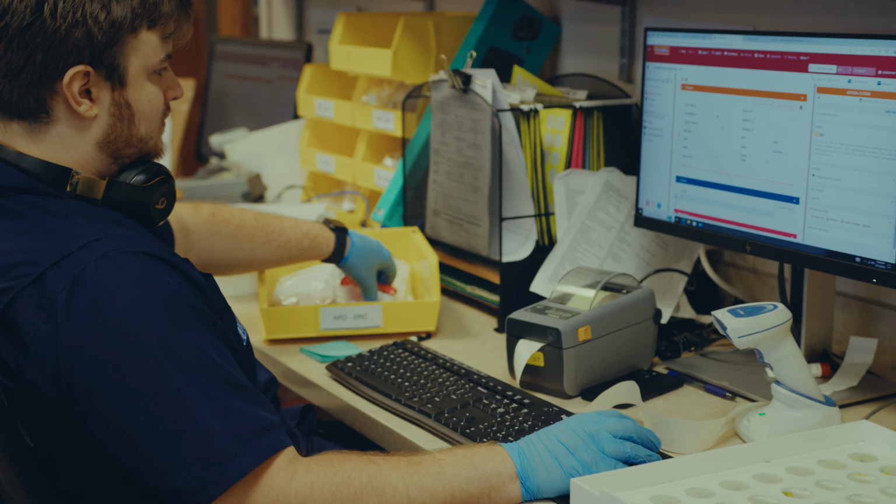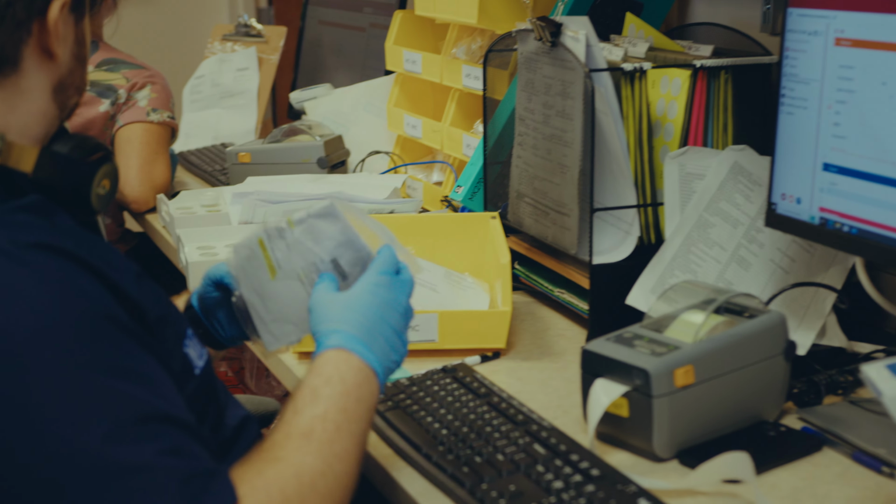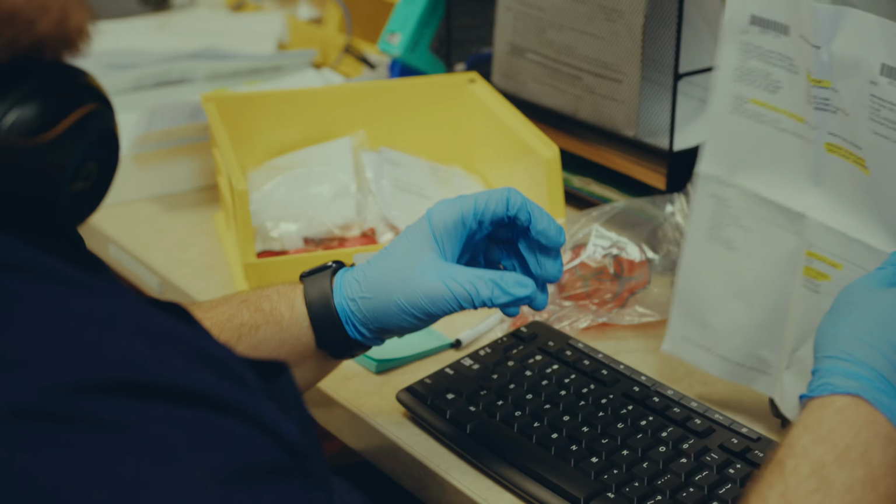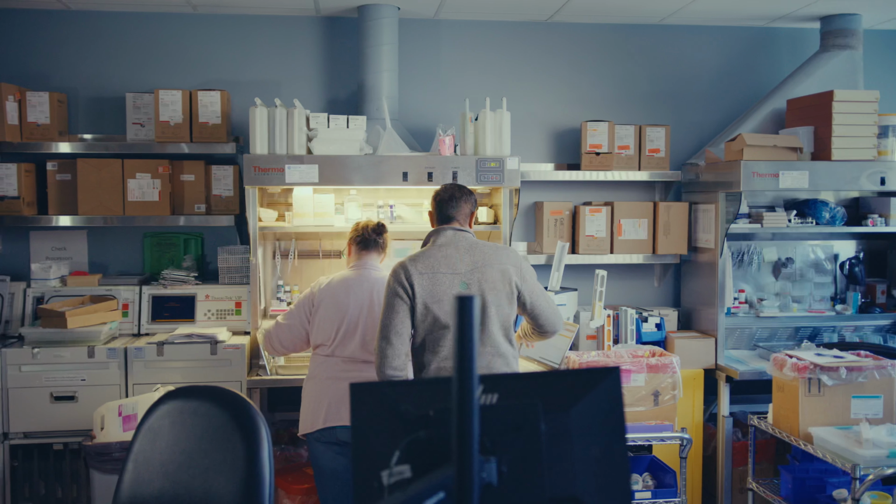The process of ordering stains used to be, as I did a case, I would handwrite onto a sheet of paper, check everything against the rack and the bottle, and then manually apply a sticker, manually print slides and cassettes. If I wrote down the wrong number or I forgot to send the recut sheet at the end of the day, that would be an error the next day.